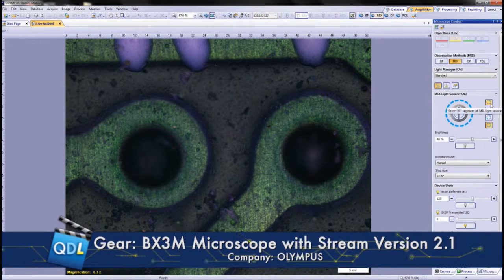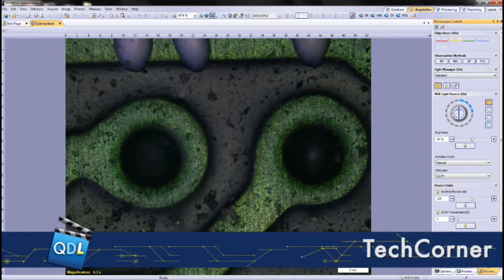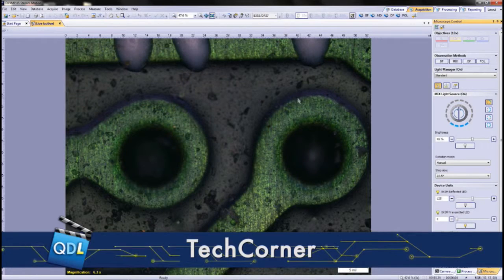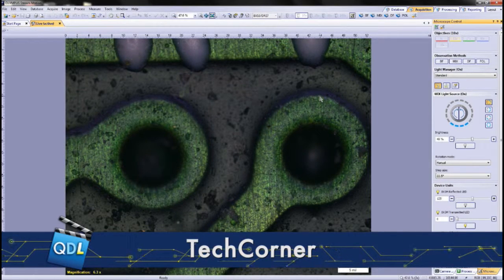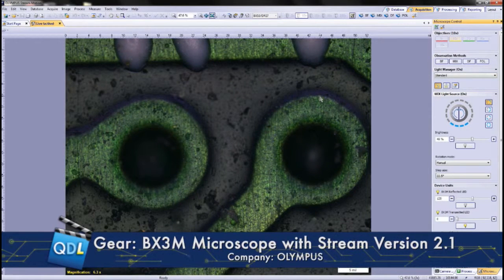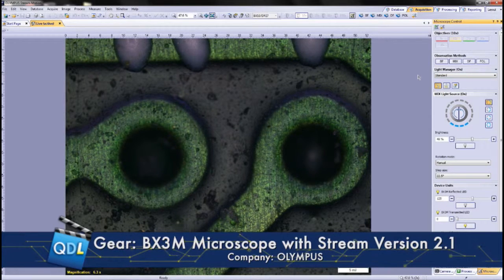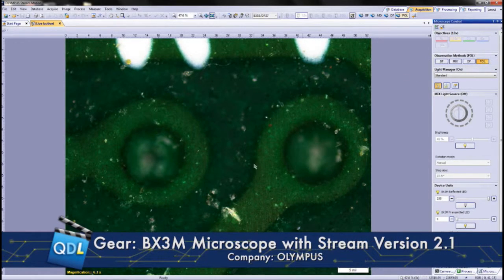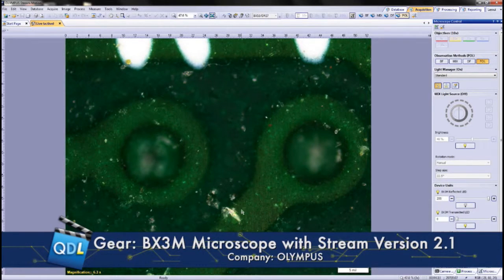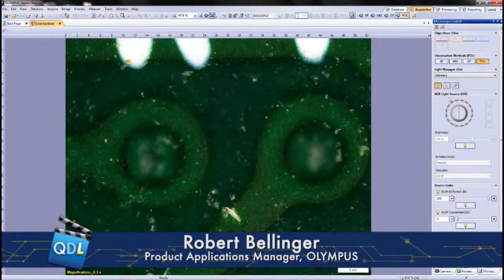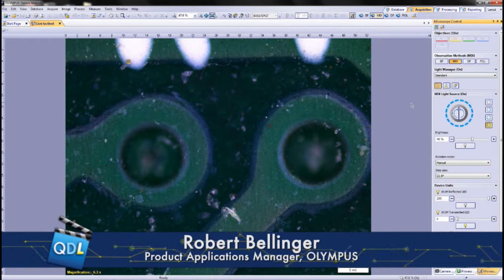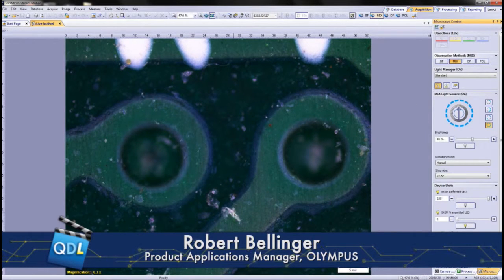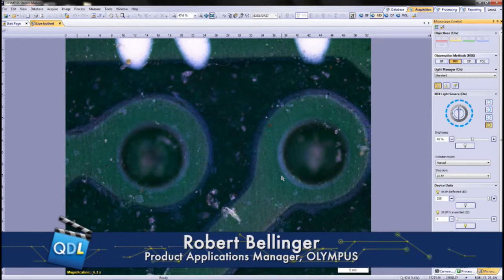We can also turn on the quadrant right from the software using the microscope control interface tool window, which lets us rotate the lighting. As I click through, you can see the angle of lighting change, giving us much more contrast at different sides and angles of the sample surface than normal bright field. Switching the mirror turret to polarization highlights things that are slightly out of phase — like contaminants on the surface — but we lose background information. Turning on mix mode again gives us the best of both techniques: polarization highlighting plus full background information.